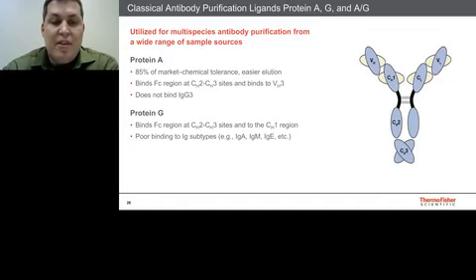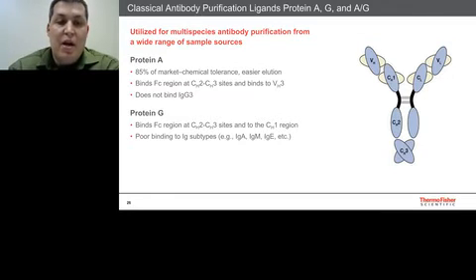The specificity of protein A and protein G to non-human antibodies can vary greatly, and care should be taken when choosing ligands for a non-human antibody. In most cases, they are complementary in that if protein A does not bind or binds weakly to one species, protein G will bind strongly to that species.